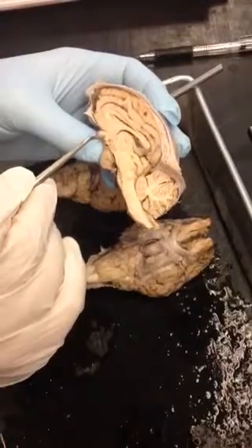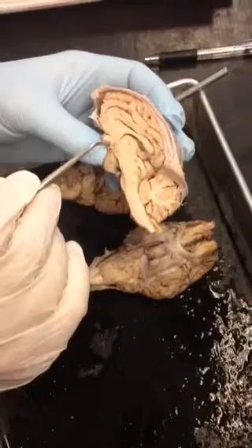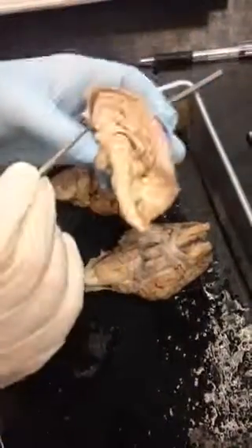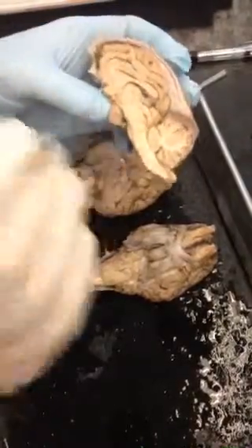Remember we said the pituitary gland. What's this right here? We already looked at it on the bottom here. I'll give you a hint. That's the bottom: optic nerve. Optic chiasma, cut in half.